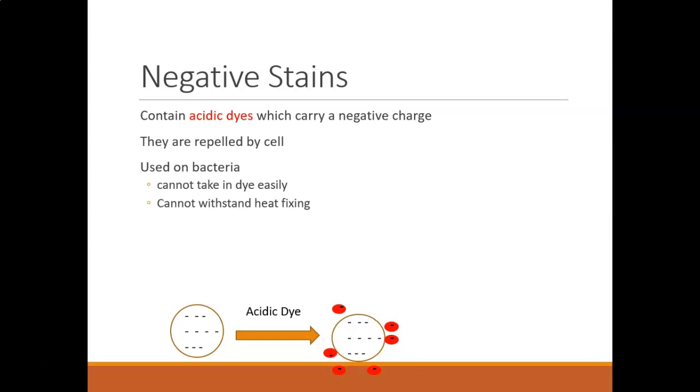So you can find out two major characteristics about your bacterial cells using the simple stain and negative stain. You can tell the cell shape and the cell size, but that's all you can tell. We tend to use simple staining for most cells, but every once in a while we use a negative stain, especially if we're dealing with bacteria that don't withstand the heat fixing as effectively, or bacteria that don't take up dyes very effectively. And so my go-to bacterial species is Mycobacterium.